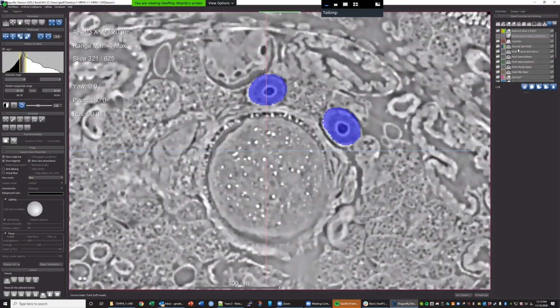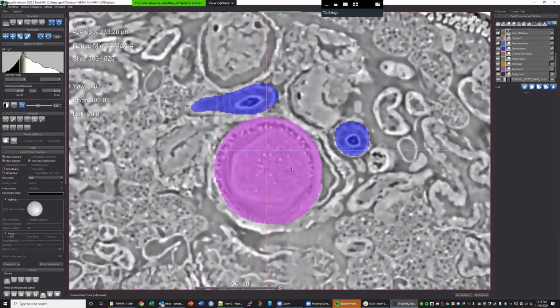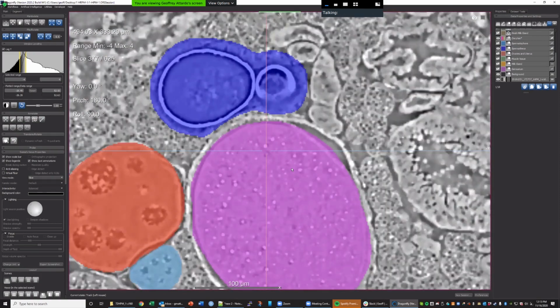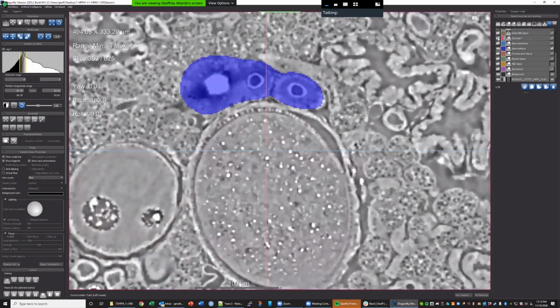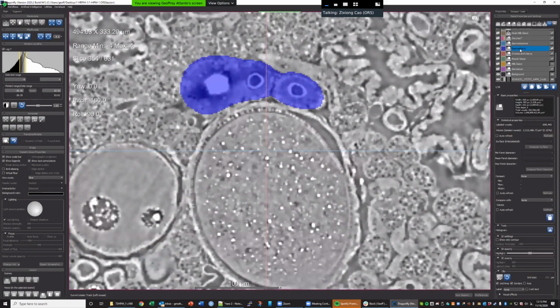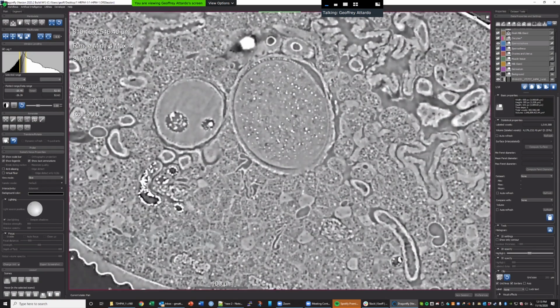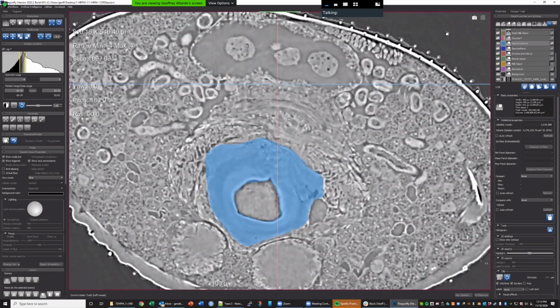Yeah, I guess we can try this, or let me see if the oocytes might be better. So this is a multi-ROI already that's got different, I think that one might be confusing. We could try multi-ROI with multiple labeling to multi-classes. Let's try this one, the spermatheca, or the spermatophore. Yeah, because I think this one's a little more consistent.